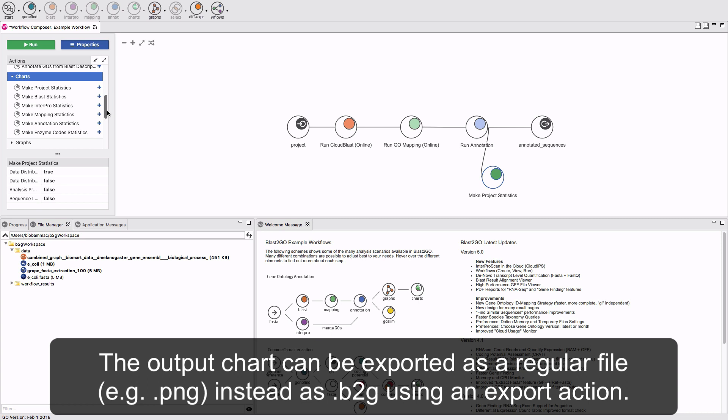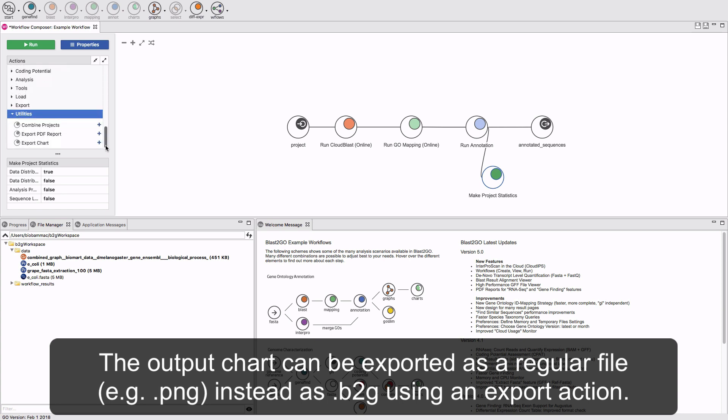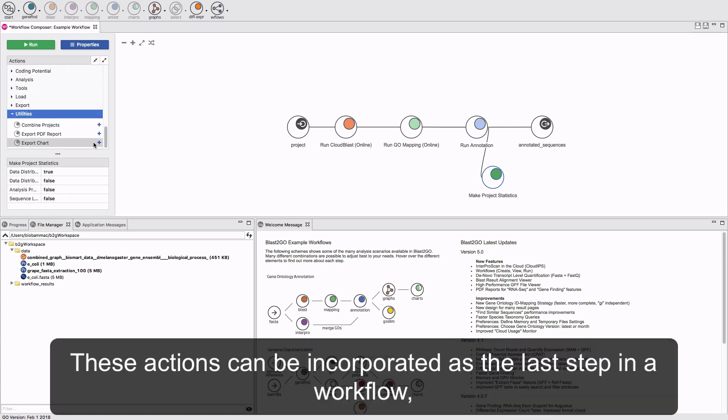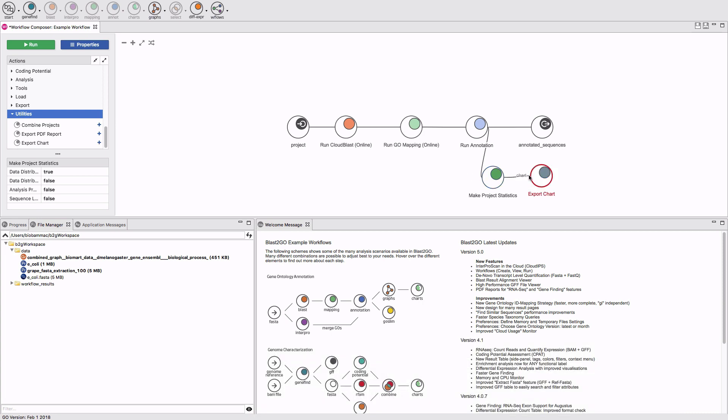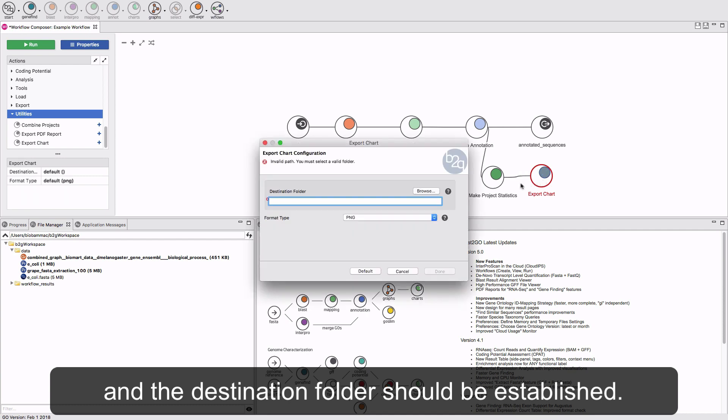The output chart can be exported as a regular file instead of a Blast2Go file using an export action. These actions can be incorporated as the last step in a workflow.